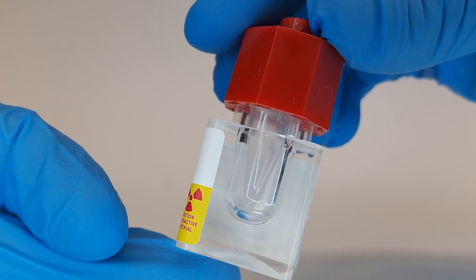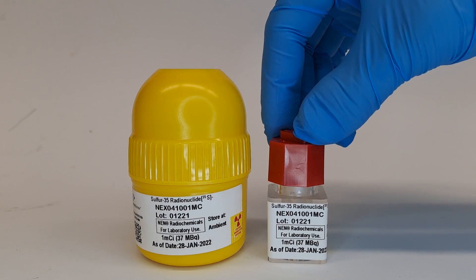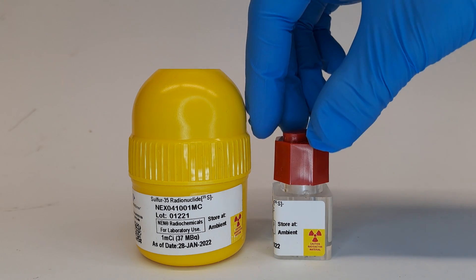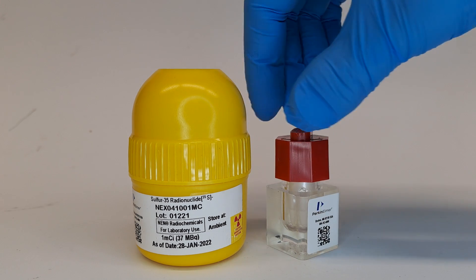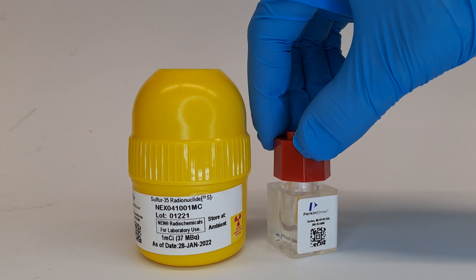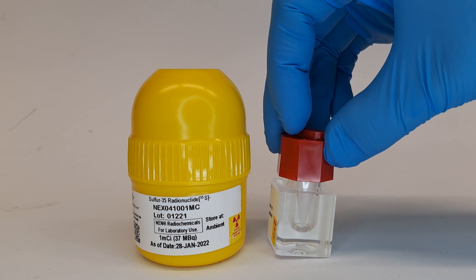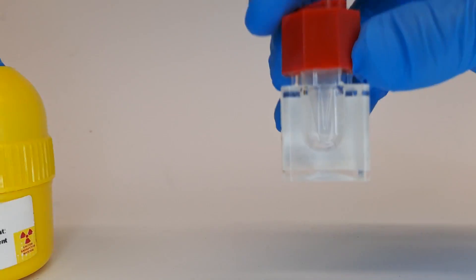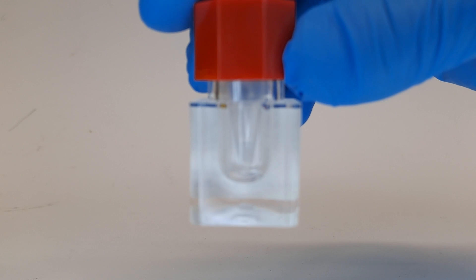We have an allowance to do that. This is quite special as some nuclear chemistry labs do not have an allowance to store radioactive waste. They have to be disposed of. But in the case of Sulfur-35 and Phosphorus-32, we are allowed to wait out their decays in order to dispose them as non-radioactive material.